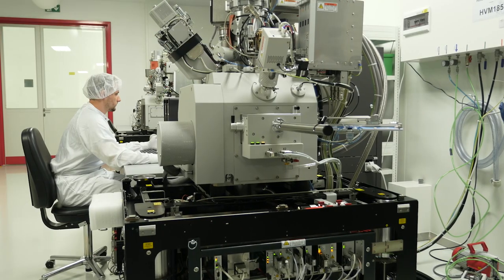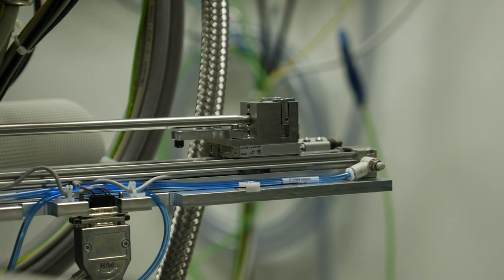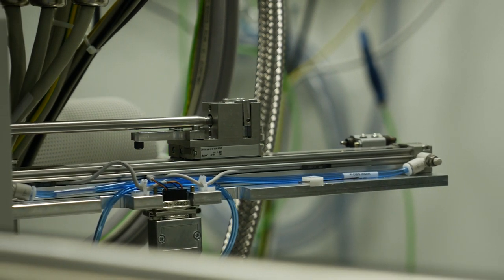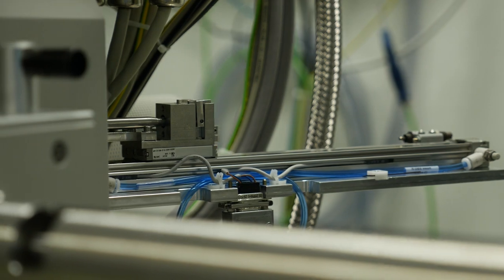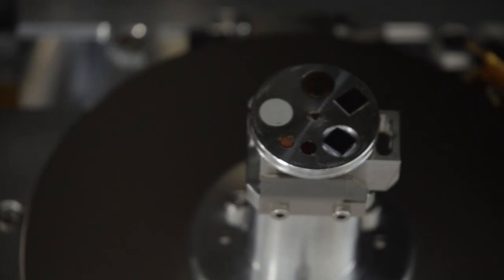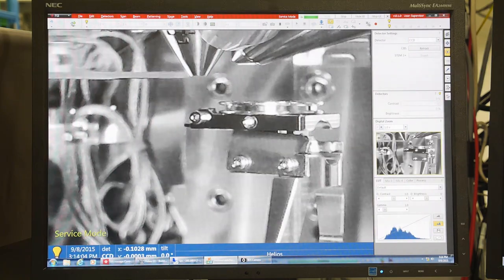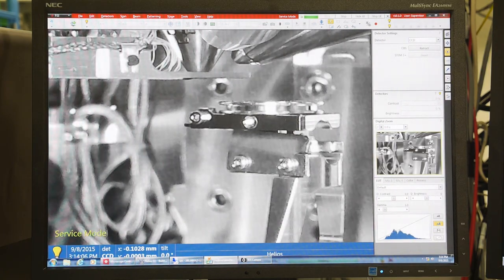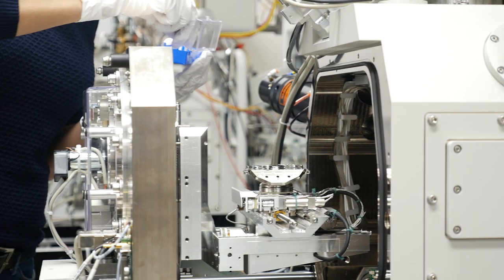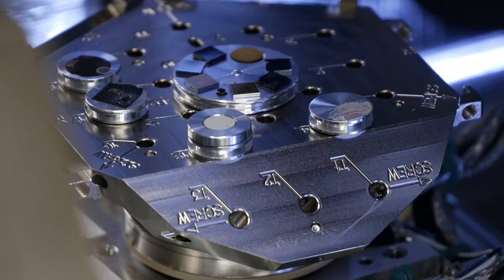On the other hand, the sample examined in the scanning microscope can be bigger, even dozens of centimeters. Therefore, the scanning microscope is always used where information about the surface of the sample is required. Yes, the only requirement is that the sample must withstand a vacuum and the irradiation with electrons. A holder is not necessary. Samples are placed in a small table, which is placed under the electron column.